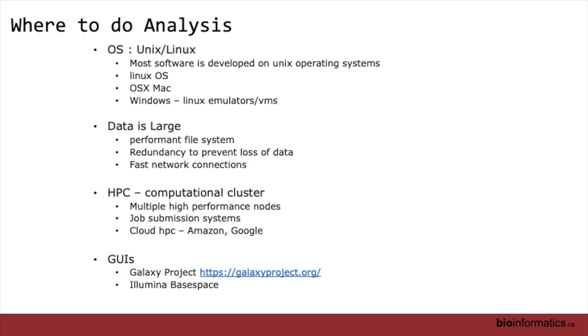Most of our work at this point is done on a computational cluster. Going back to the complexity of this pipeline, you can see a lot of things are run in parallel at the same time. We're running many, many cases, many samples at the same time. So we take advantage of an HPC system that we have on premise here at OICR to run many, many jobs at the same time, set jobs off, let them run, and come back and look at them later on. Lots of monitoring and making sure everything's working properly.